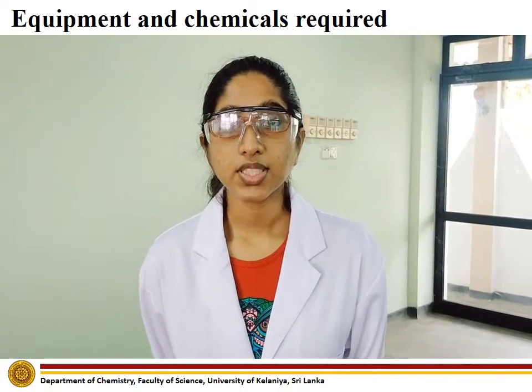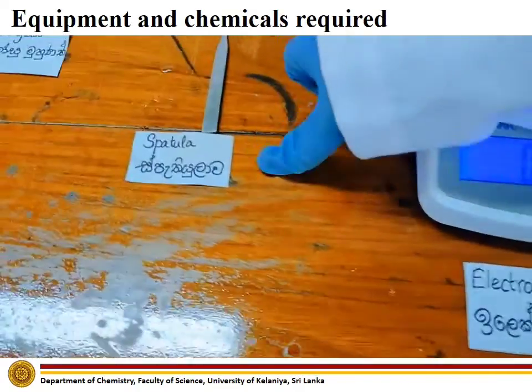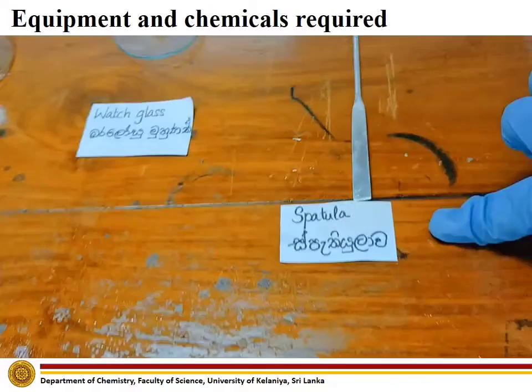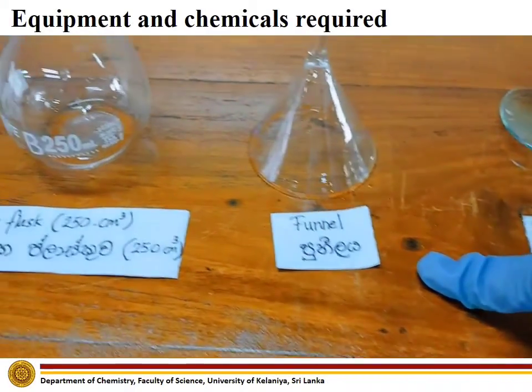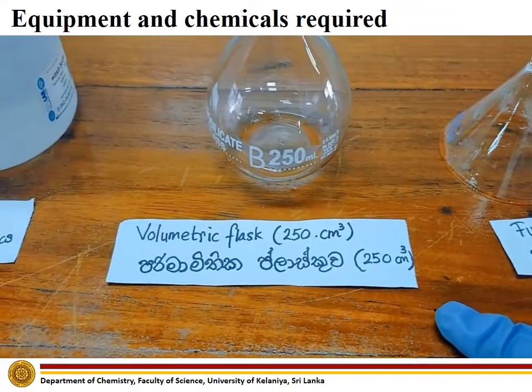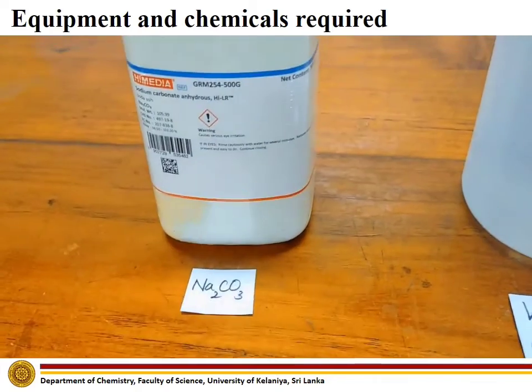Chemicals and equipment required to carry out this experiment are: Electronic Scale, Spatula, Watch Glass, Funnel, Volumetric Flask, Wash Bottle, and Sodium Carbonate.